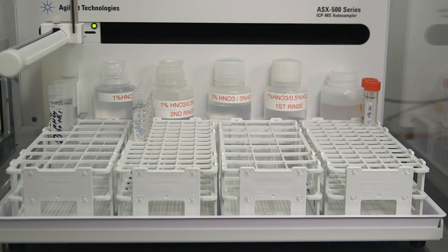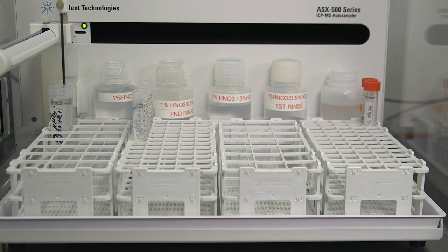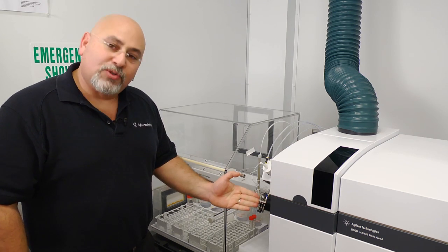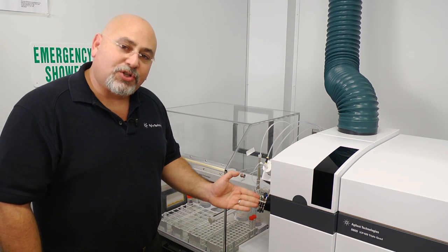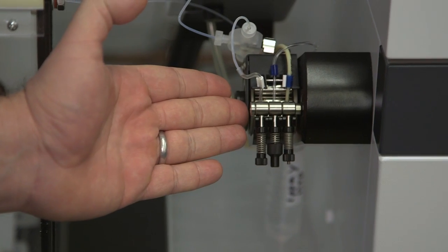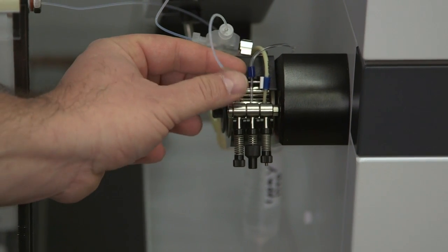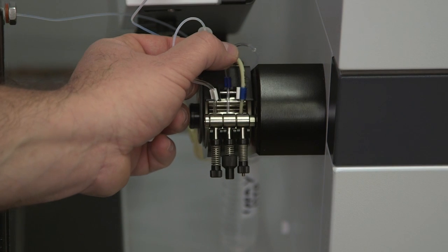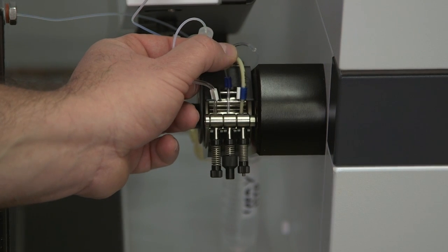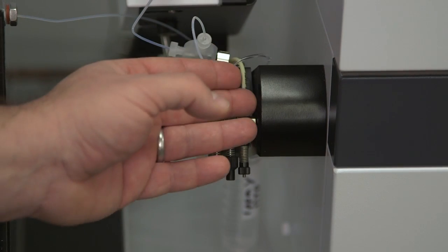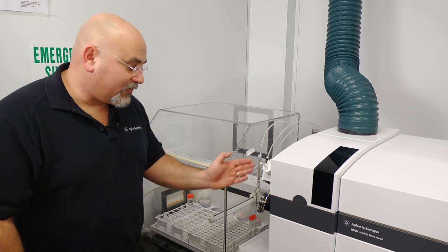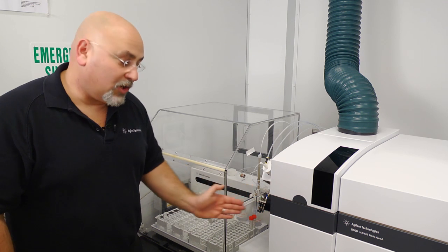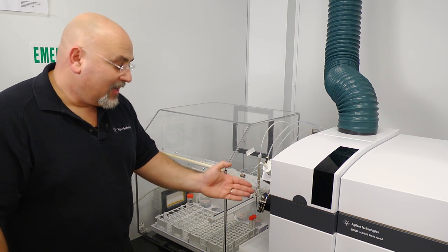Samples are typically in an autosampler, which go through the samples they're taking for analysis. We are using a three position peristaltic pump. The first position is for the sample uptake. The second position is for the internal standard, while the third position is for evacuation of the waste.